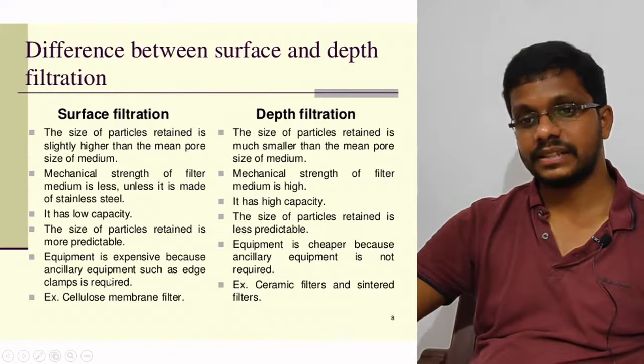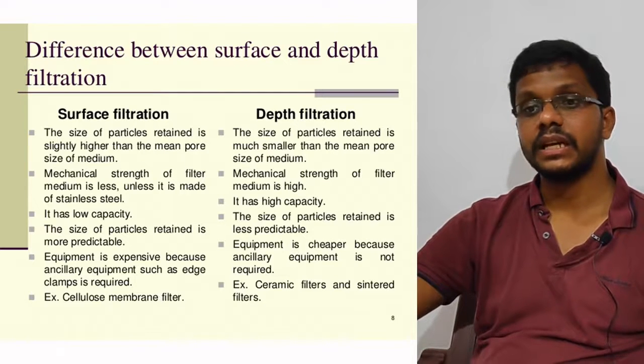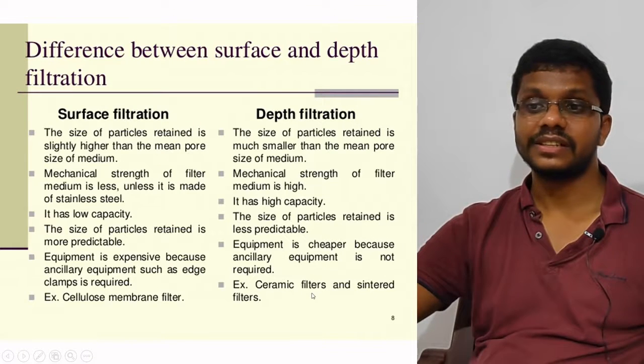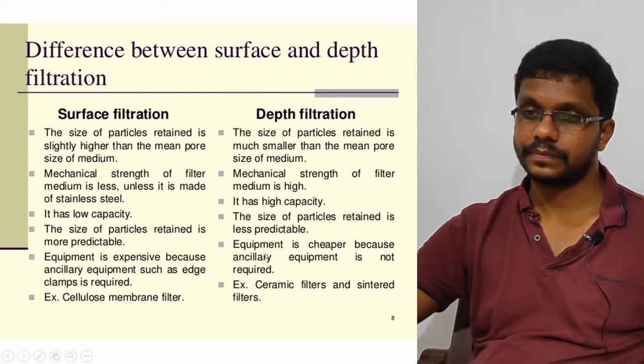Examples of surface filters: cellulose membrane, Whatman number one filter paper, then we have nylon membrane. Everything is included in surface filters. For depth filters, we have ceramic filters, wood filters, sand filters, etc.